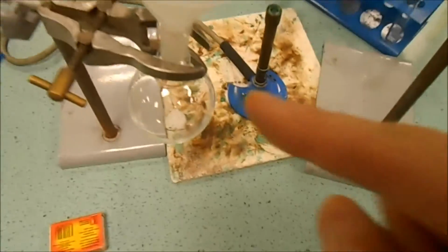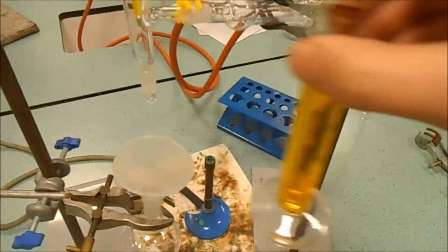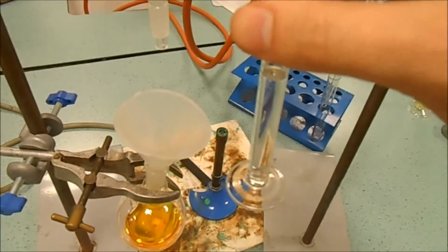So you can see in the bottom here we've got the anti-bumping granules. I'm going to add into that my acidified potassium dichromate, and into that we're also going to add my propan-1-ol.